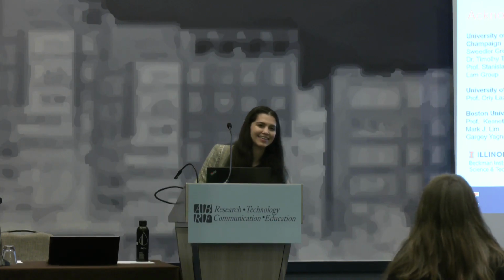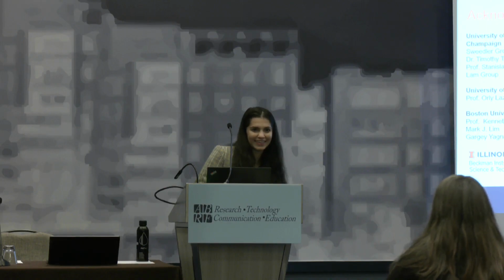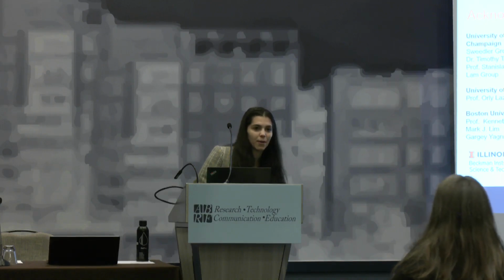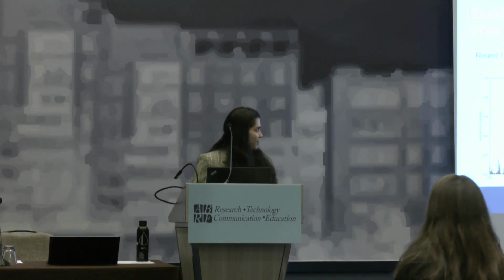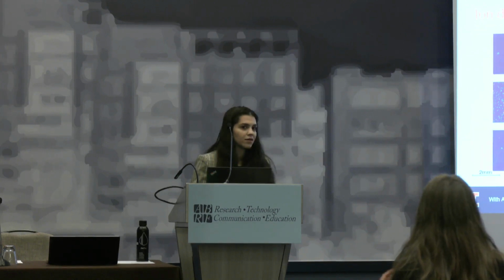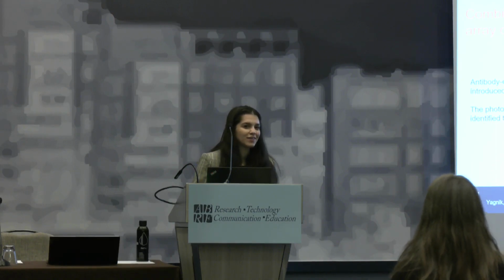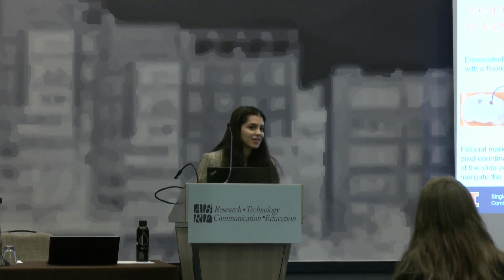Yeah, thanks. So I don't come from a mass spec or MALDI background, but I was curious if you could talk a little more about the sample preparation of having a full slice of tissue on a slide, when what I know is mixing the matrix and analyte and spotting. How do you make sure that you're ionizing everything you want versus something that just preferentially desorbs when you have such a complex sample system?